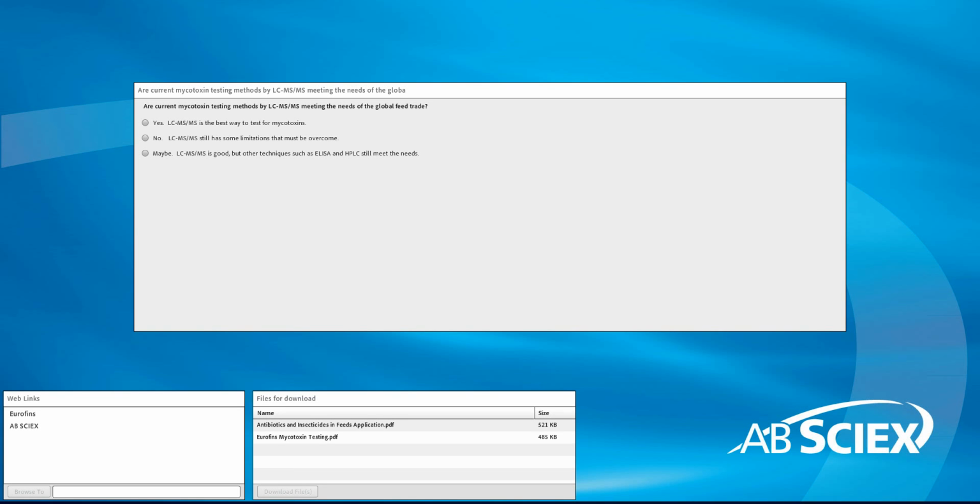So for our next audience poll, the question is, are current mycotoxin testing methods by LC-MS/MS meeting the needs of the global feed trade? And the choices are yes, LC-MS/MS is the best way to test for mycotoxins. No, LC-MS/MS still has some limitations that must be overcome. Or maybe LC-MS/MS is good, but other techniques such as ELISA and HPLC still meet the needs.